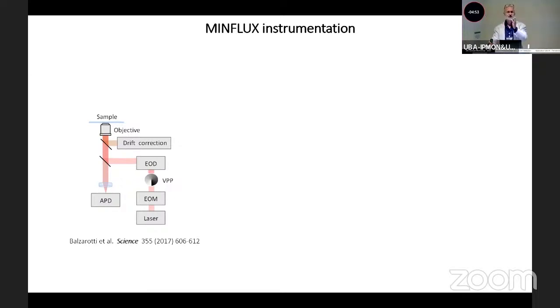And at the same time, DNA paint, these new fluorophores are providing so many photons that you can achieve also 3-5 nanometer localization precisions on a wide field microscope. And if you're labeling with anything, the labeling error is larger than this. So it doesn't make sense to go to sub-nanometer localization precision if your labeling has an error of 3 or 5 or 15 nanometers, right? But for tracking, this could be very, very interesting.